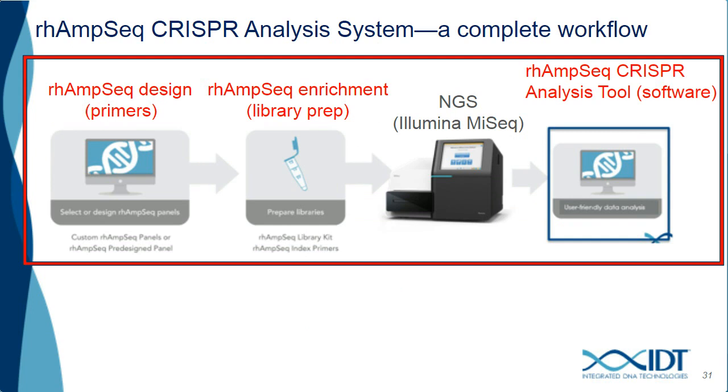All these components make up the rhAmpSeq CRISPR analysis system, and as a part of this effort, we also characterize performance of this system on internal data sets to help provide experimental recommendations.